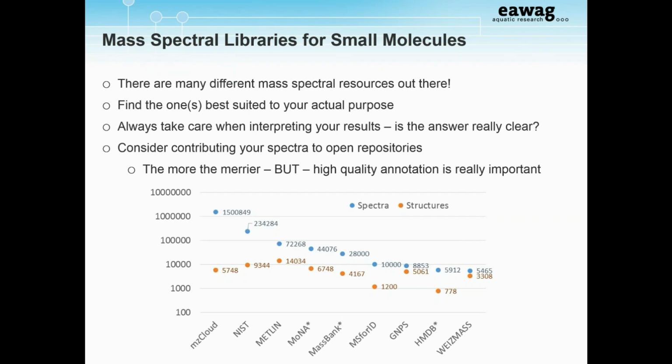And this is another way to convince yourself, again with the power of a bigger compound database without necessarily spectra, to see if you've got a very unique match or if actually everything with that formula is very similar and you've got a very low chance of telling them apart.